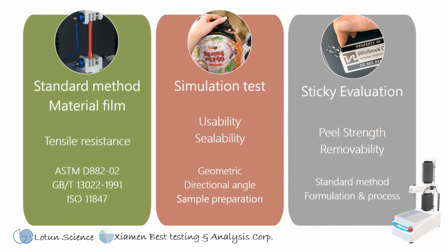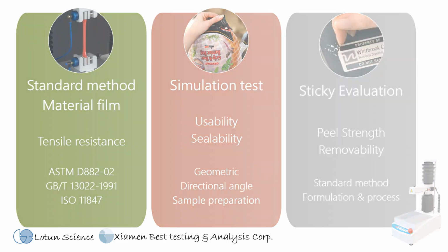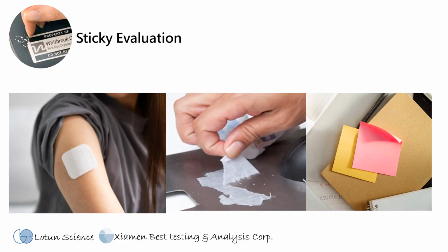In the final part, we'll look at how tensile testing applies to adhesive performance evaluation. When using tape daily, residual adhesive is a common issue, especially with low adhesion tapes like medical patches or sticky notes. These tapes may apply easily but leave residue when removed, potentially damaging surfaces or causing discomfort.